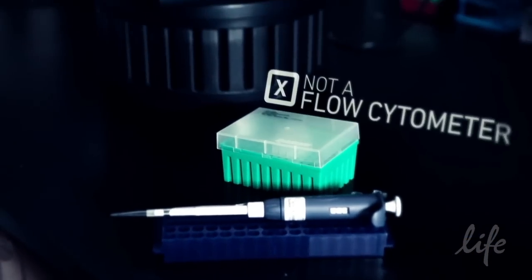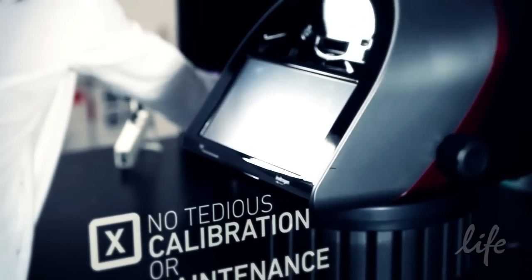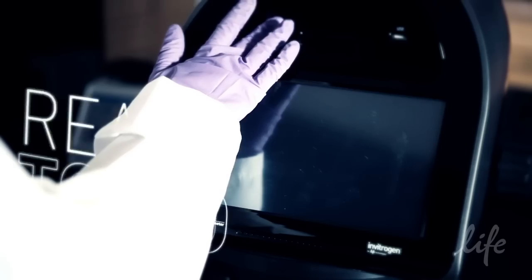Unlike other benchtop cell analyzers, TALI is not a flow cytometer and does not require the same extensive calibration and maintenance. Just flip the switch and you're ready to go.